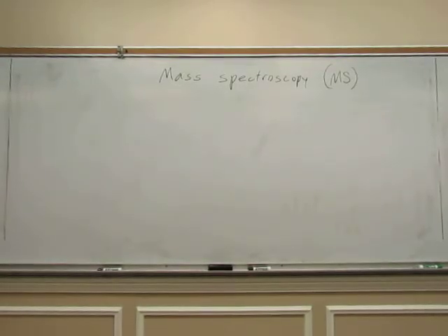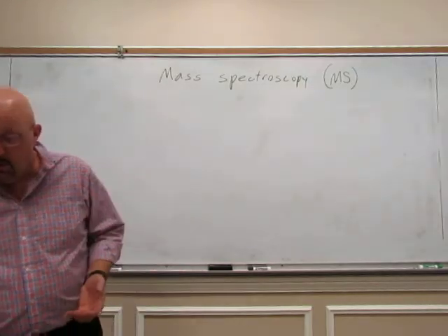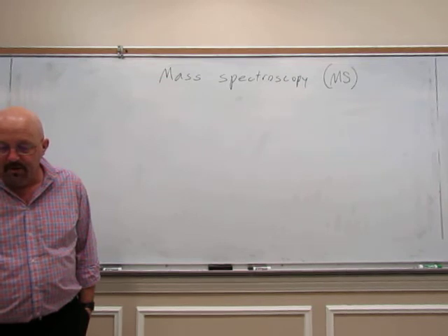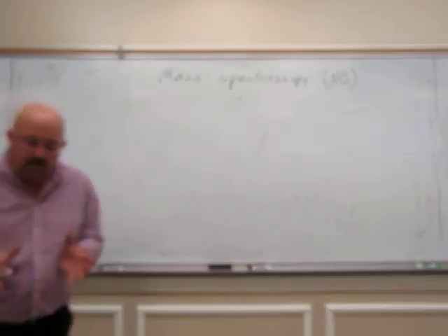Now, with mass spectroscopy, like I said, we don't get much information. We get the molecular weight and a few pieces of the structure. But let me give you some background information on how it works. It works basically the same as almost any instrument.